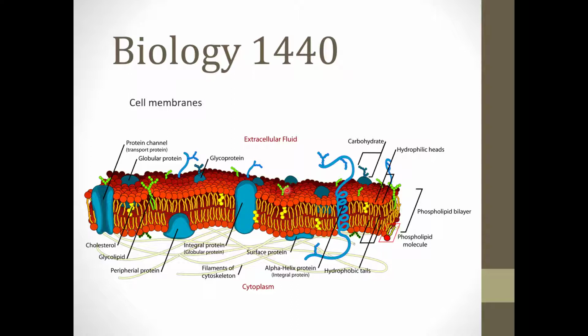And why in the world would we use garden beets? Who cares about beets, right? But garden beets are a great model organism. A lot of times scientists will use a model organism to study a system because the organism's easy to manipulate or offers some benefit for the experiment. In this case, beets have a cell membrane that looks quite a bit like ours, quite a bit like those of a bacterium as well, or even the phospholipid layer that surrounds the coronavirus.